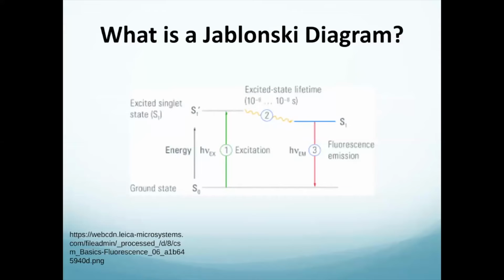So that elevates or excites the molecule to a higher level, an excited state, and it stays there for a very short lifetime. As you can see, number 2, it starts immediately to lose some of that energy on the order of 10 to the minus 9 to 10 to the minus 8 seconds, which is about a billionth of a second.